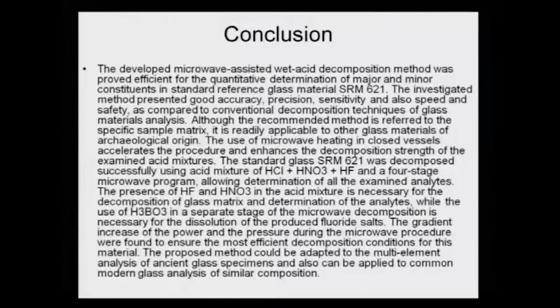The use of microwave heating in closed vessel accelerates the procedure and enhances the decomposition strength of the examined acid mixtures. The standard glass SRM 621 was decomposed successfully using acid mixtures, hydrochloric acid, nitric acid and hydrofluoric acid, and a 4-stage microwave program allowing determination of all the examined analytes was carried out.